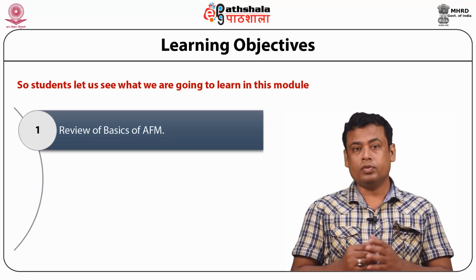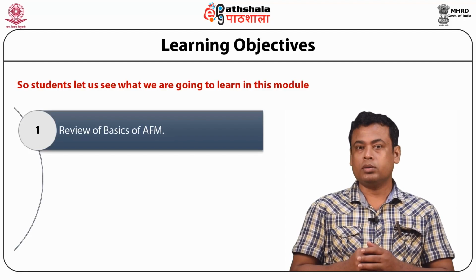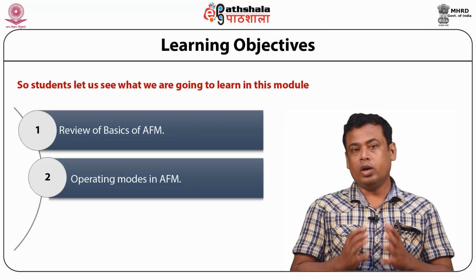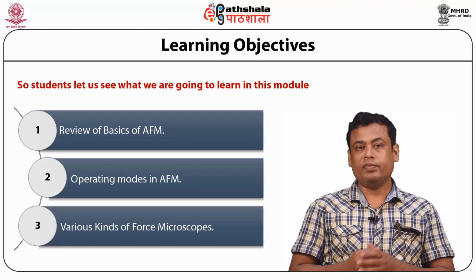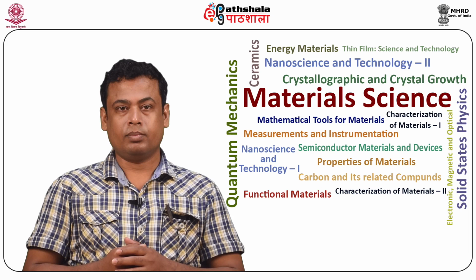First, we will review the basics of AFM that we learned in the last module. We will learn about the operating modes in AFM, and we will see the various kinds of force microscopes available.